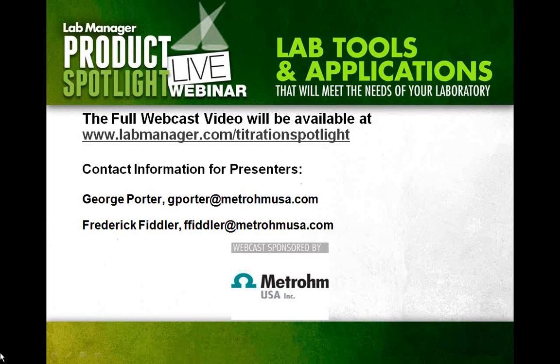If that is the case, certainly we can, because a lot of times if you're investigating this technique for new products, you will need to run it to establish what your detection limits are and so forth. We would strongly recommend, however, before sending in samples, that you send us an email, so we can give you the proper documentation to fill out prior to sending in these samples.